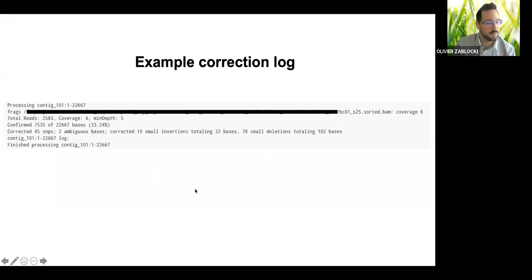This is what it shows you. Sometimes it's not that clean and it just can't find any resolution because of not sufficient coverage, for instance. And when you run Pilon, you can tweak its behavior. For example, you can instruct it to ignore a correction if it does not have a certain minimum coverage threshold value, for instance.